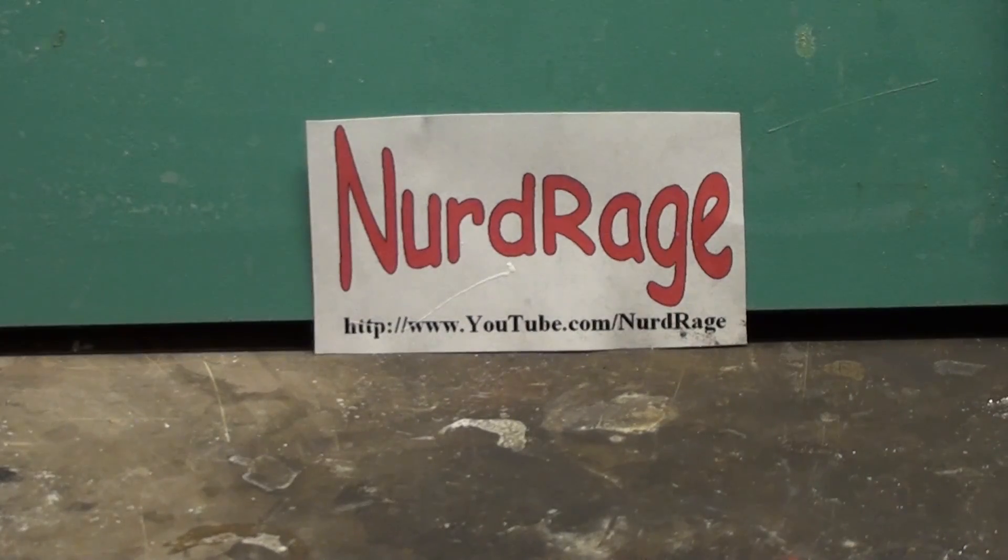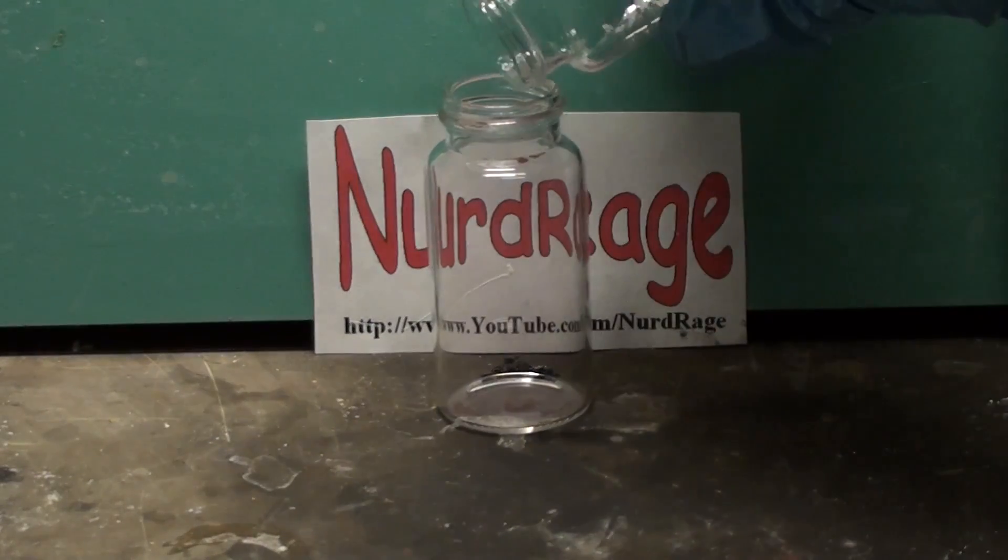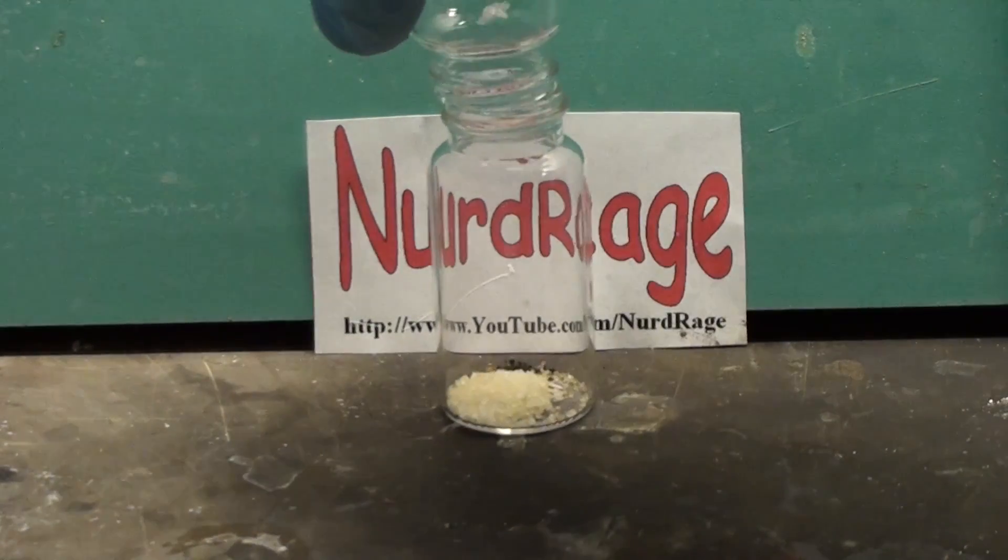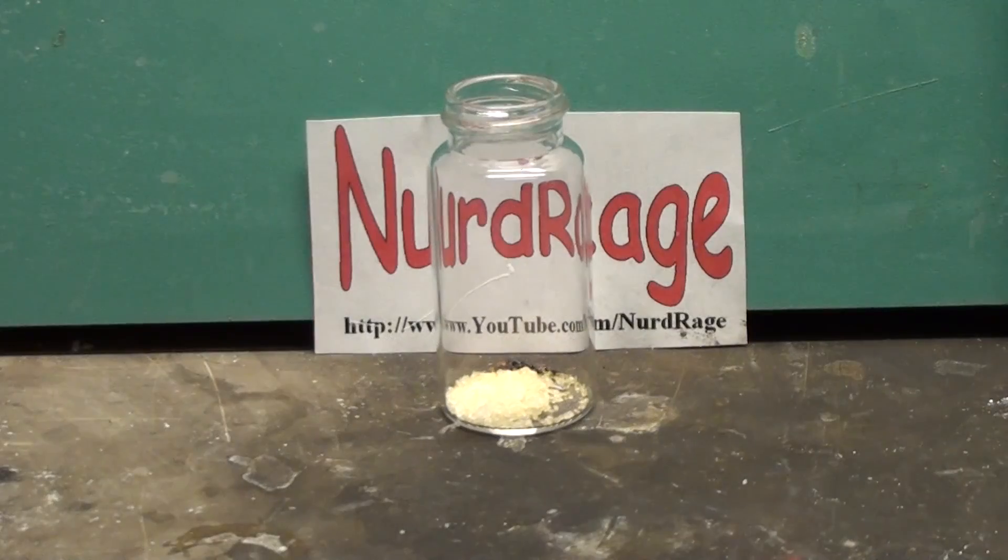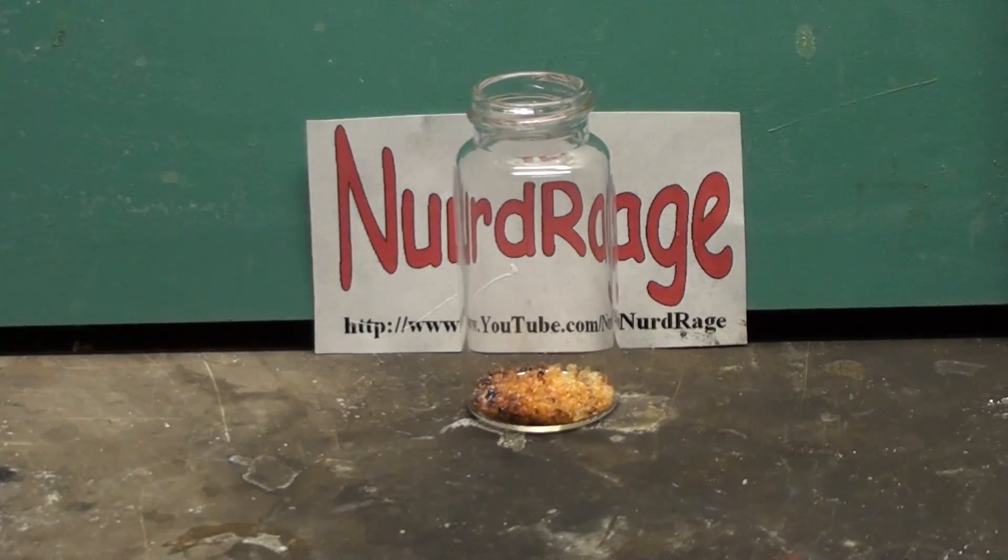Now we need to make the electrolyte solution. First start with 127mg of pure iodine crystals and add to it 830mg of potassium iodide. Already you can see it reacting to form brown potassium triiodide. Add 10mL of anhydrous ethylene glycol and mix until it's dissolved.